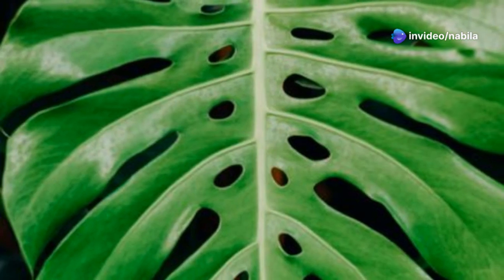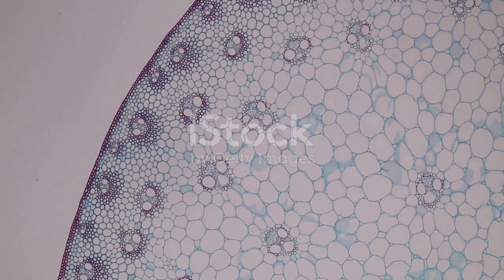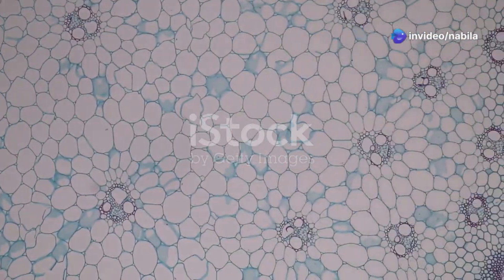Monocot plants have guard cells that are dumbbell-shaped. This shape is different from the kidney-shaped guard cells found in dicots. They function in a similar way to dicot guard cells, controlling the exchange of gases through the stoma. This gas exchange is essential for photosynthesis and respiration.